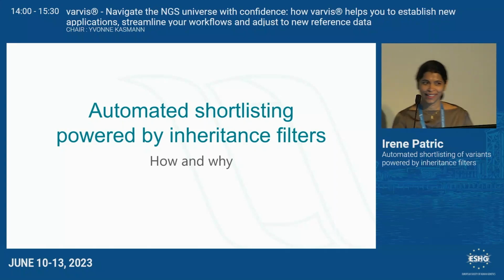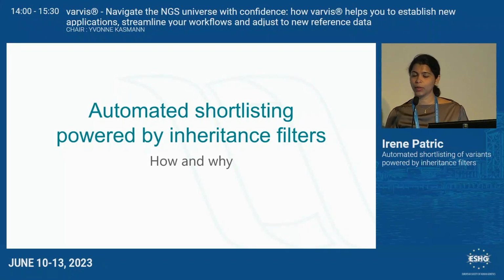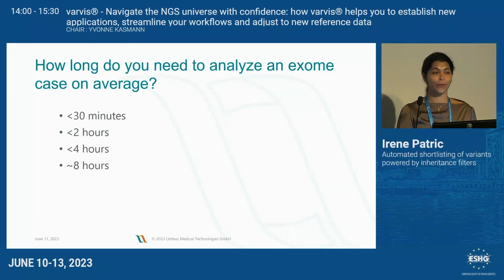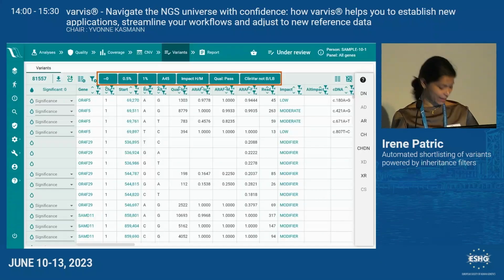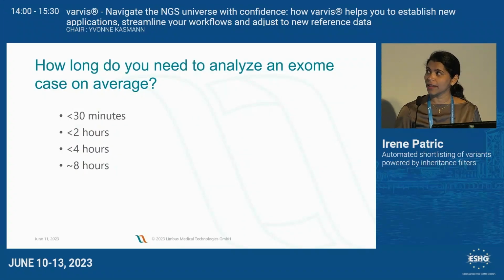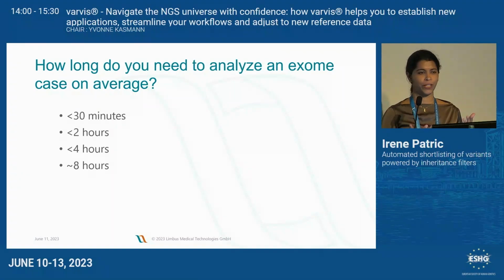Thank you, Yvonne. I'm happy to talk about the inheritance filters, how they normally work, how at varvis we work towards improving these, and why the technical details are important. Thank you for asking this question already on how long it takes to complete a case on average. It can range anywhere from 15 minutes to a couple of hours.